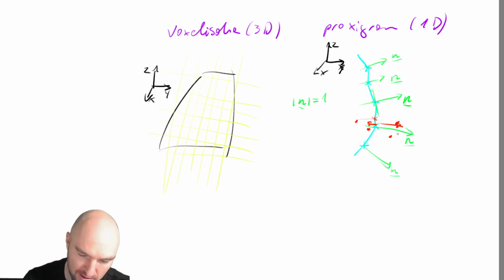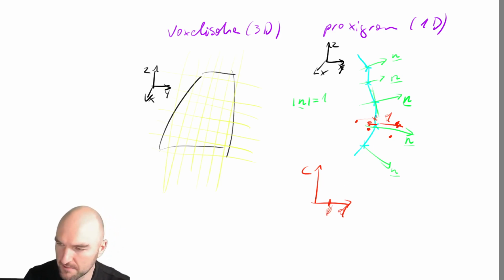And then we are getting this distance variable d here, and this is for our proxygram. It's a histogram of concentration versus this distance d. And the distance is 0 where our mesh is. In our case, this is where our grain boundary is. This could obviously be an isosurface, and the distance would be 0 where the isosurface is.